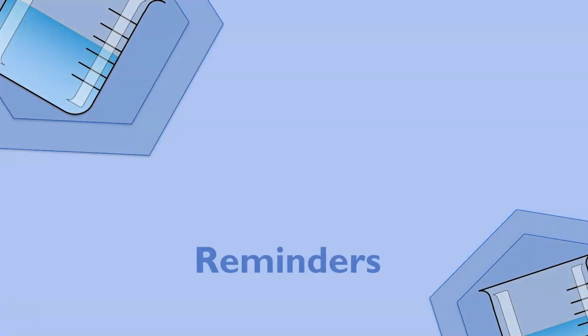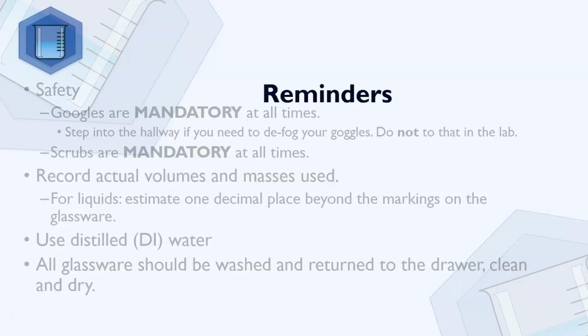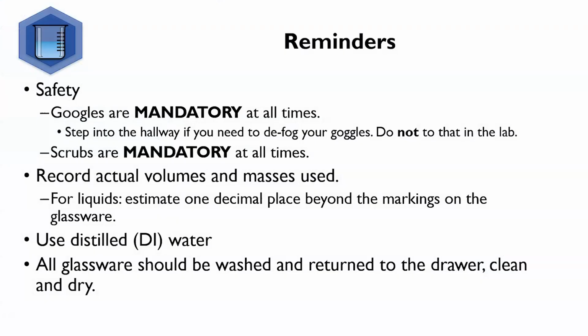Experimental notes. A few reminders for this experiment. First, laboratory safety must always be followed. You must wear your goggles the full time you're in lab. If they fog up, please step out into the hallway and wipe them off. Do not take your goggles off while you're in the lab room. You are also required to wear your scrubs in lab once they've been handed out.